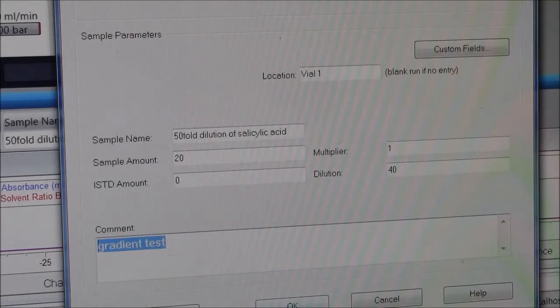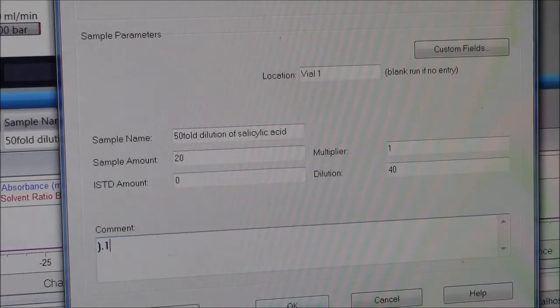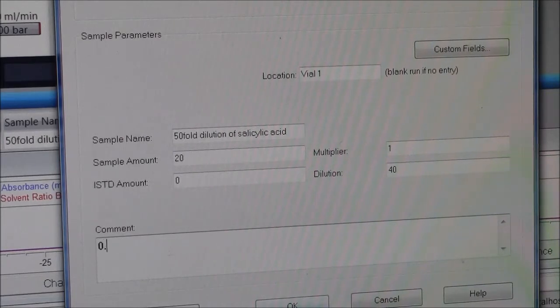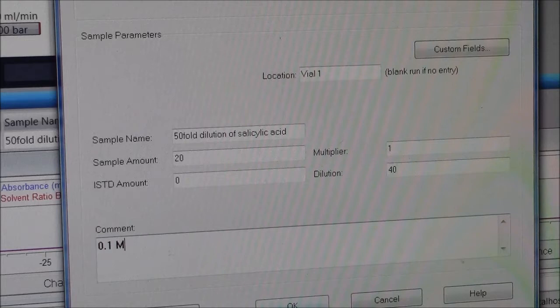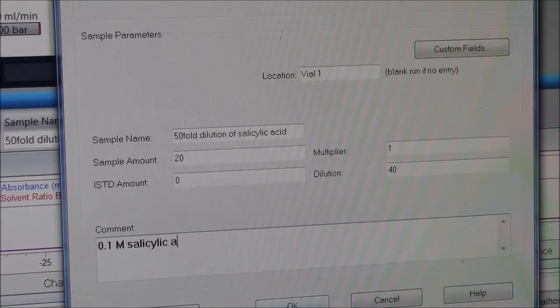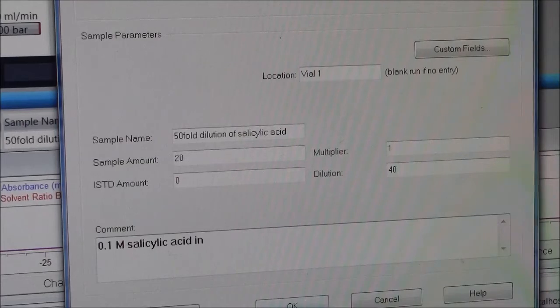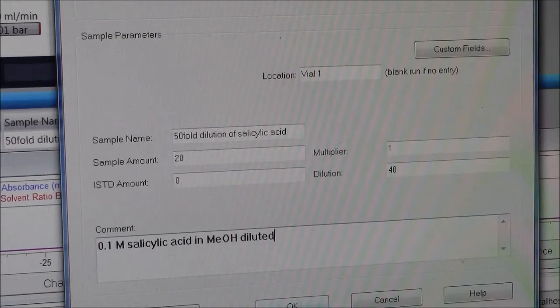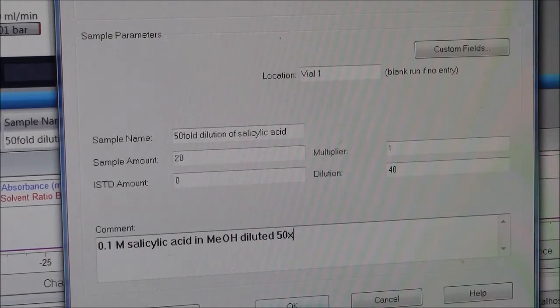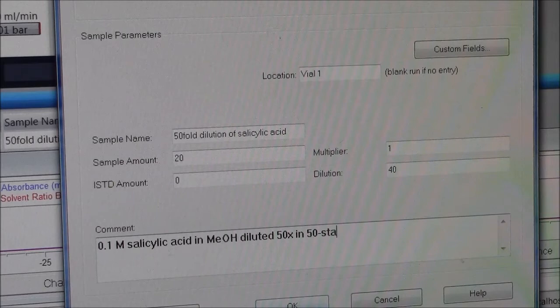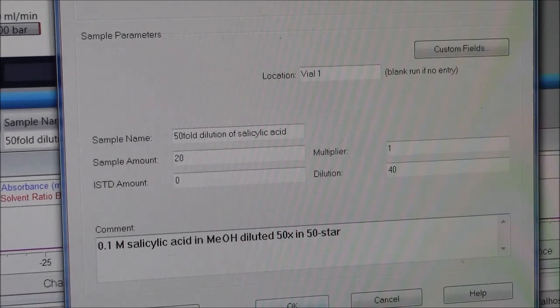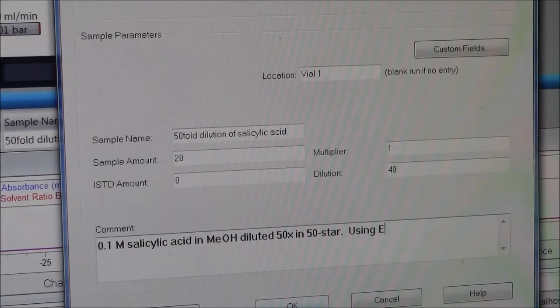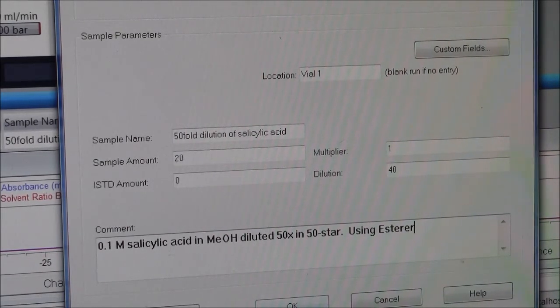So this was 0.1 molar salicylic acid in methanol, diluted 50-fold in 50-star. We can say the method is using the esters method. That's helpful.